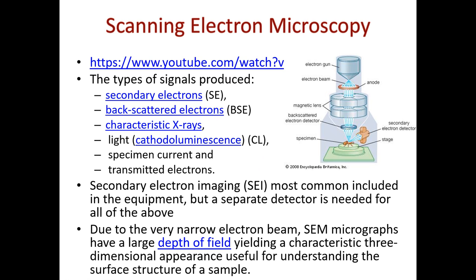All right. So again, MRI can be useful for anything that has water. It can be spatial and temporal. However, below 10 microns, and for materials such as sandstones or natural materials that might have magnetic components, that's not a good option. Very, very widely used is scanning electron microscopy, which essentially takes a polished surface or unpolished surface, and you shoot an electron beam from a source, and then you detect. Every time you send either a ray or an electron beam, there will be interaction with the matter. That interaction with whatever material you're imaging will scatter some of that beam, and you can record that.